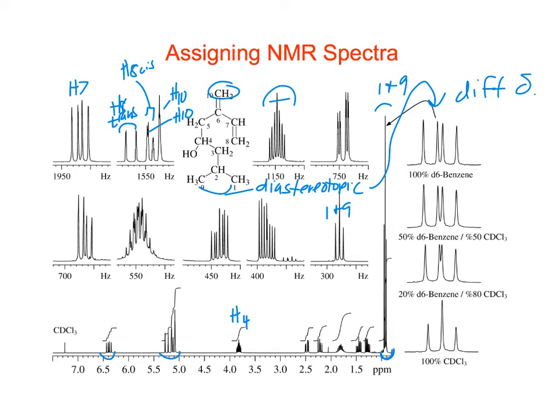So the rest of it are just the CH2s. So we got a CH2 at 5, a CH2 at 3, and a CH at 2, right? So we have all of those, and they don't have any functional groups on them.